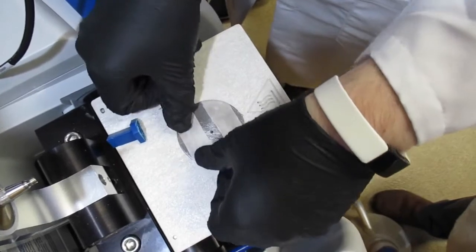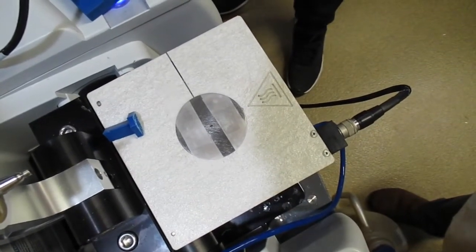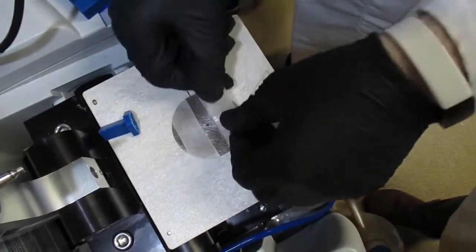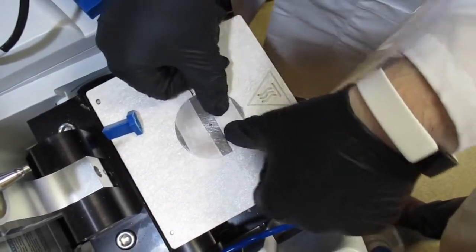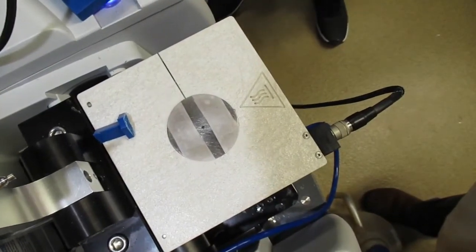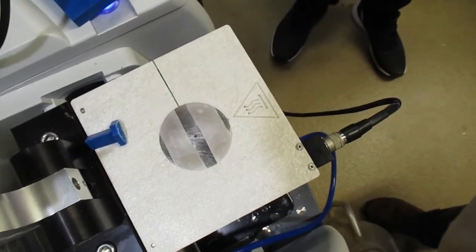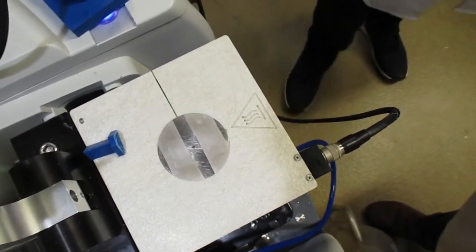And you want to tape down the glass cover to ensure that the glass cover is the actual thickness of the tape from the bottom of the sample to the top. And then you have to wait about a minute for it to start, before you start.